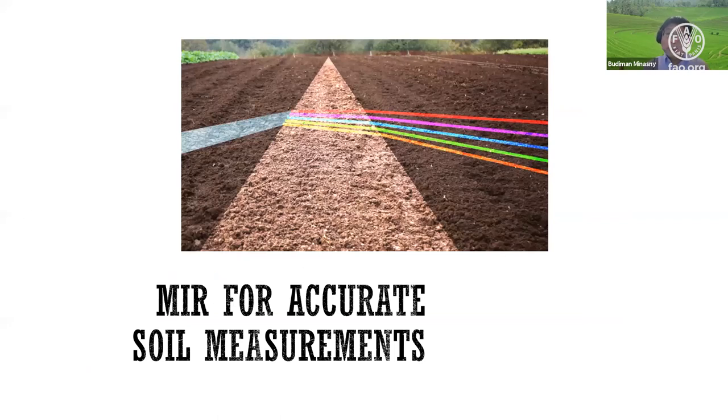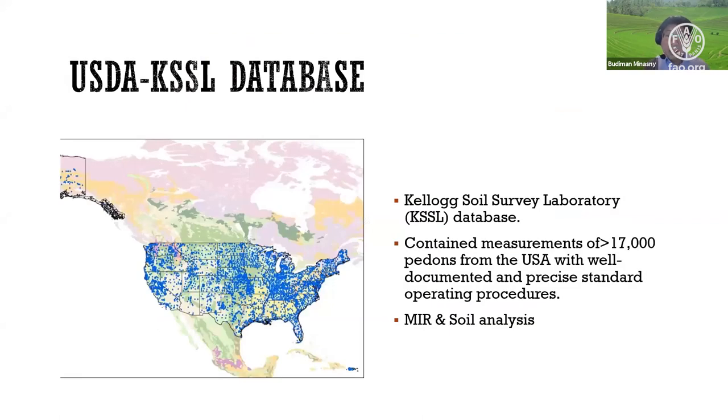Now we're going to look at the mid-infrared. How accurate is mid-infrared for measuring soil properties? I'm going to go through an extensive list of soil properties, and we can discuss it. As we said before, to make a prediction we need a spectra, but we also need a standard lab measurement, to build these calibration functions.